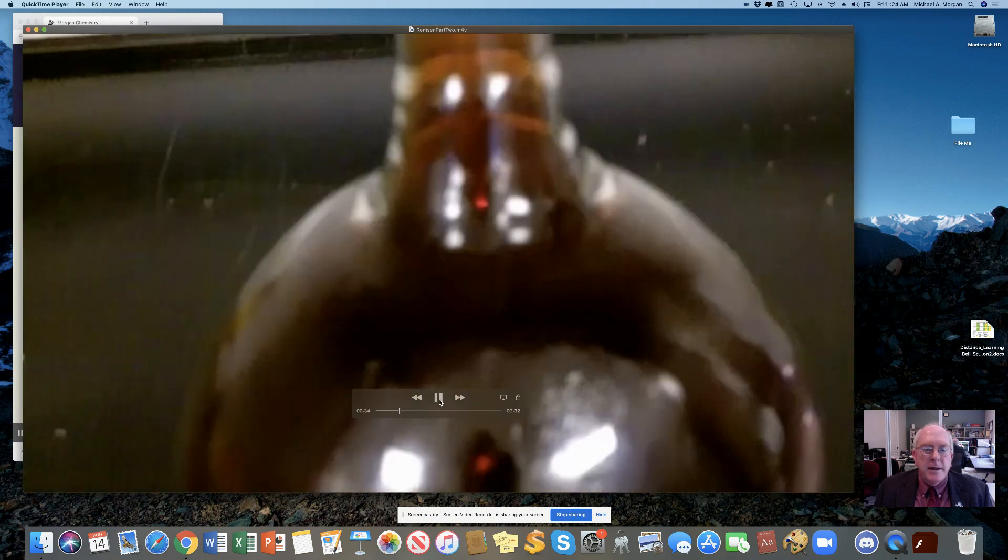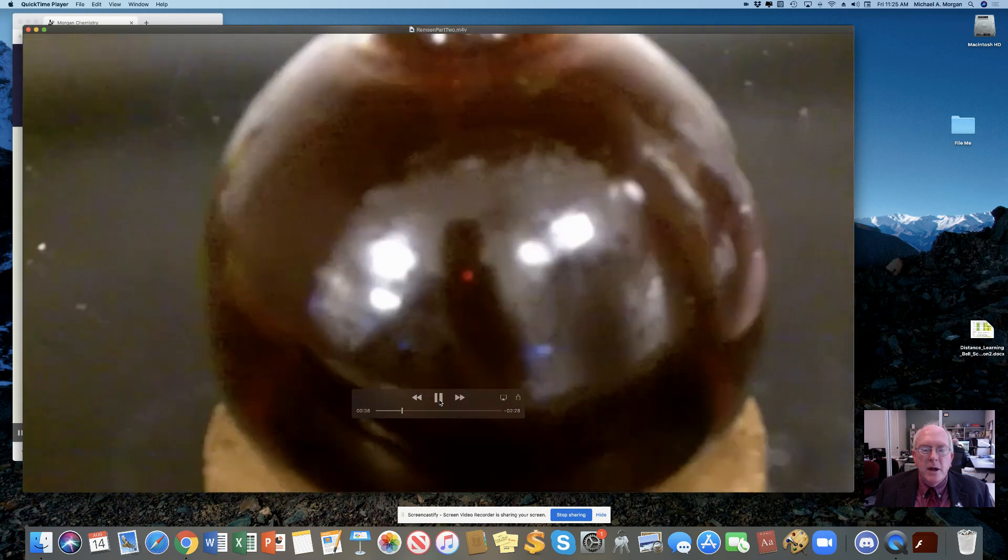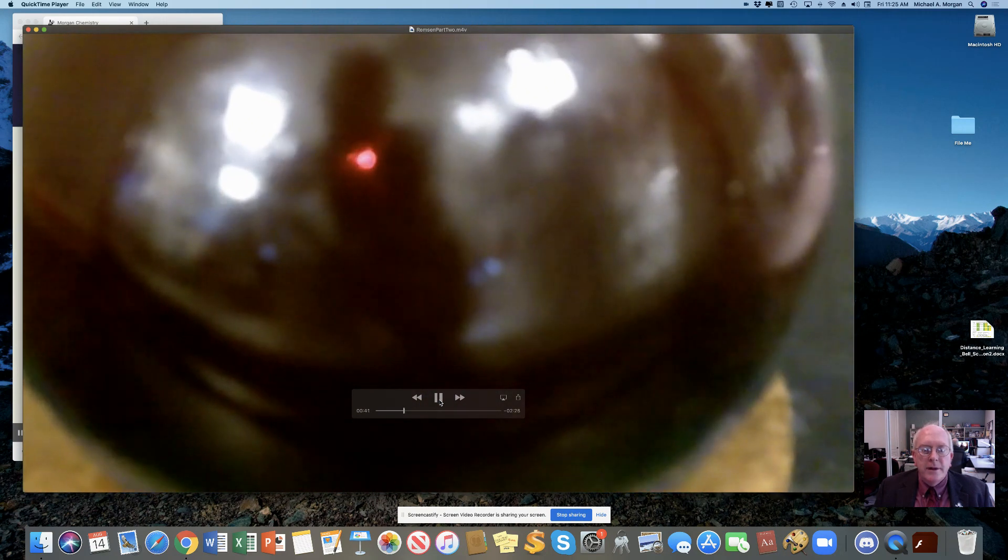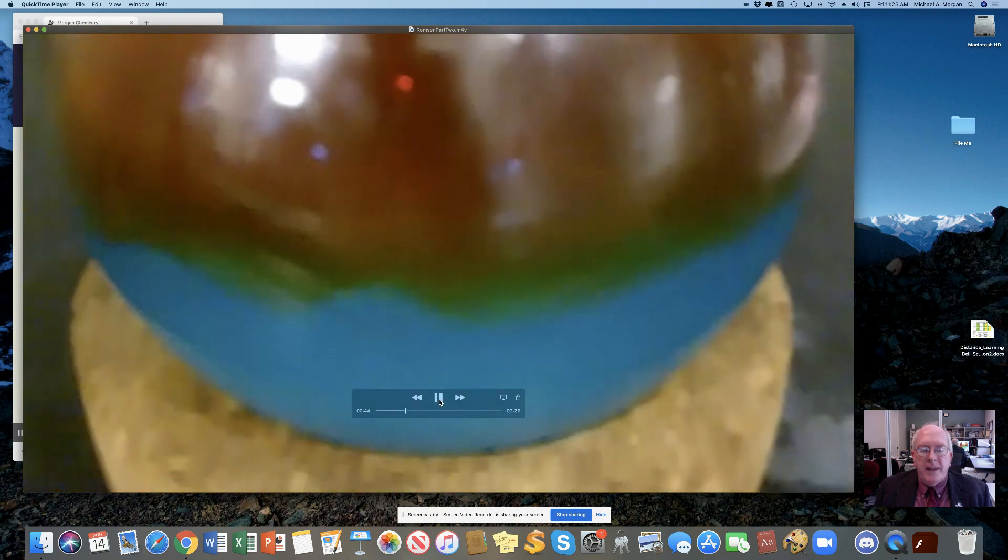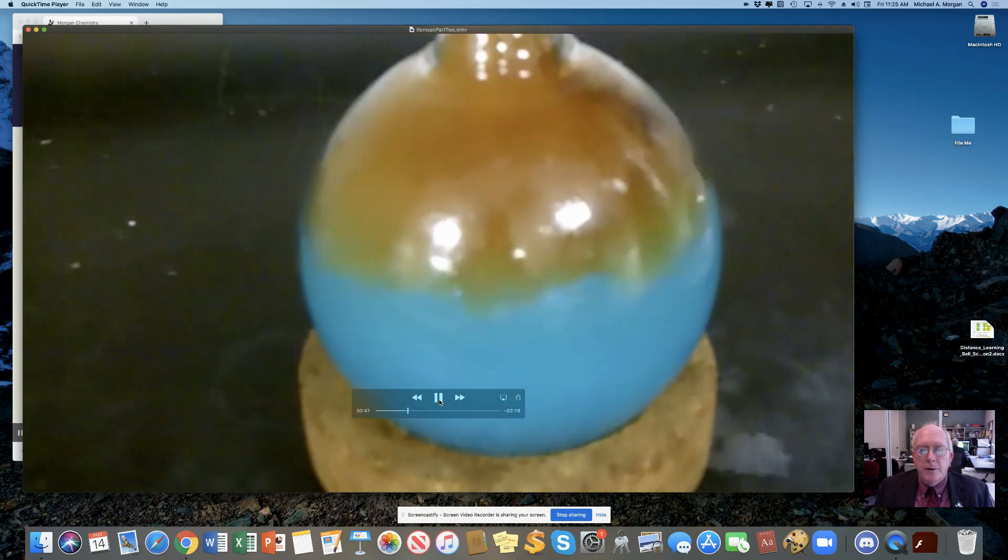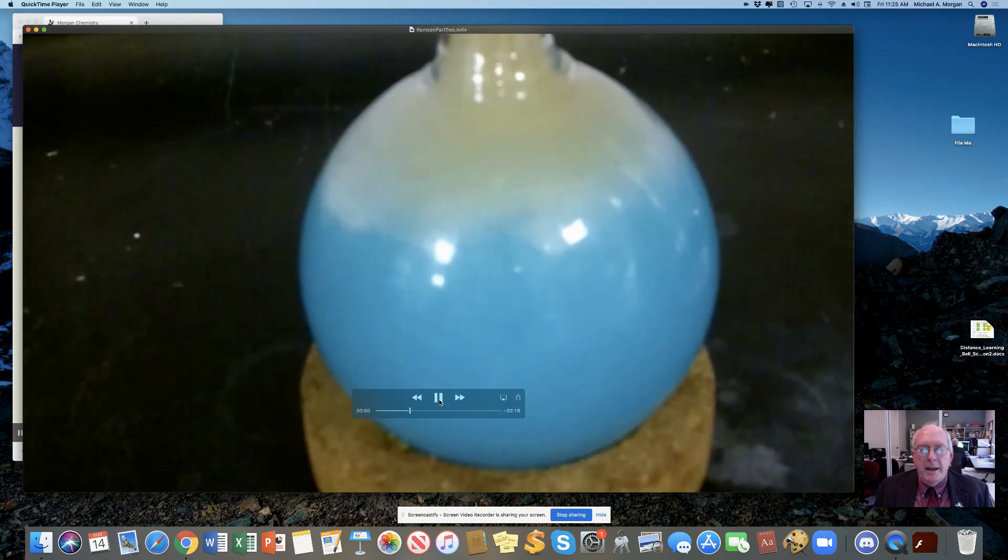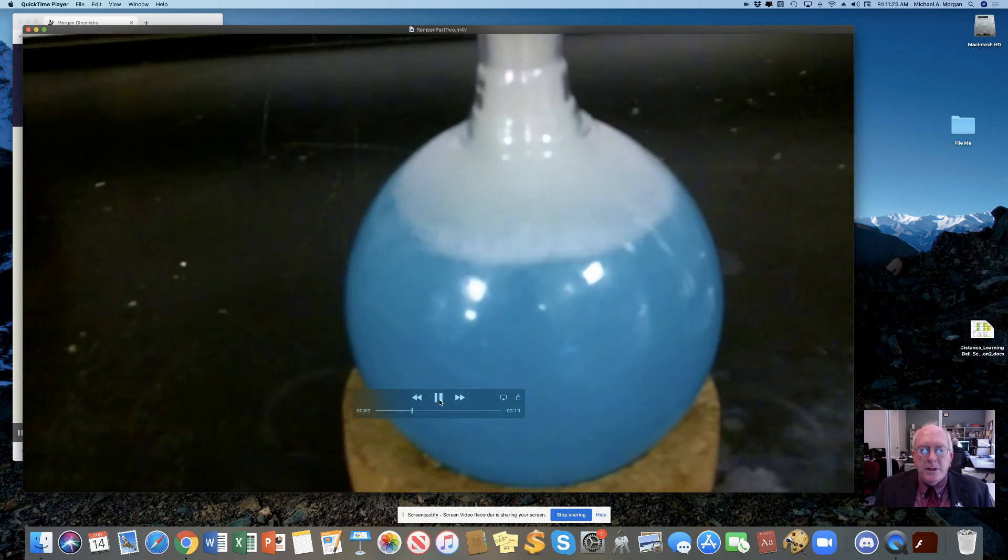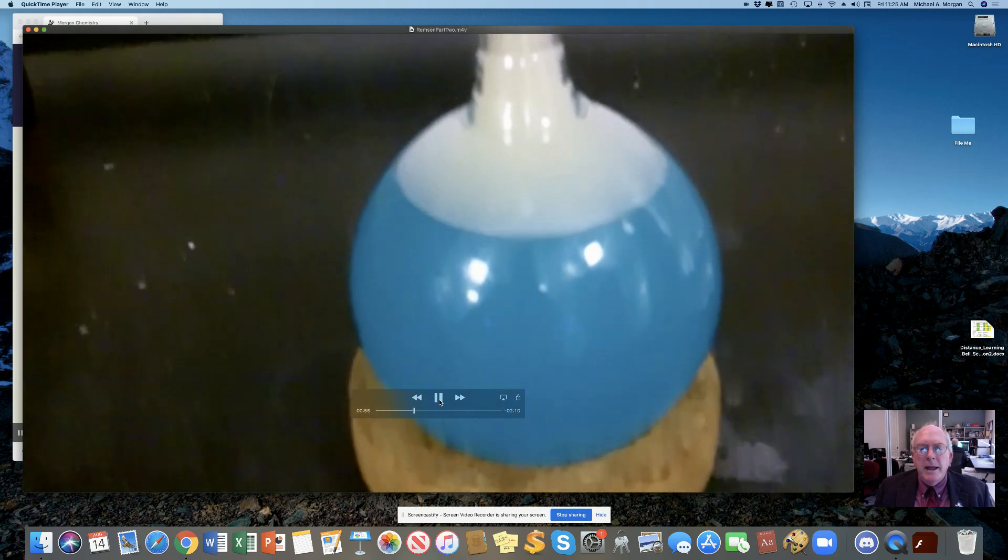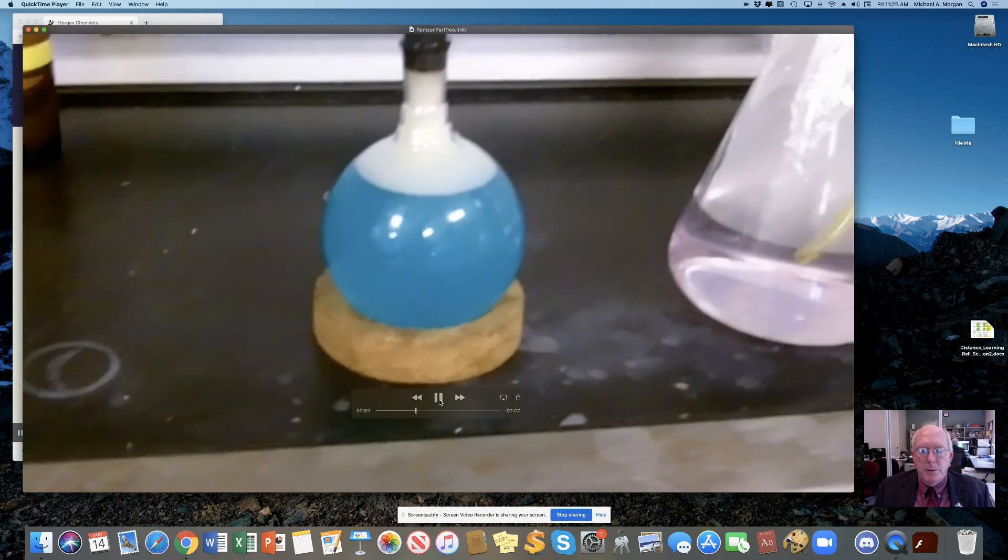Then it's going to go all the way across and into that round bottom flask. A vacuum has been created in that round bottom flask by that gas cooling off. And that means that the water that's in the flask on the right is going to be pushed over by atmospheric pressure. And when it hits over there, that brownish liquid, or greenish brown really, is suddenly turning to a very nice light blue color.